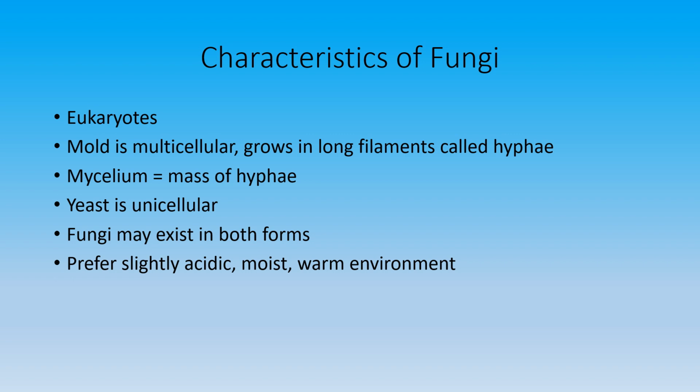Bacteria don't like that. Bacteria prefer more neutral to just slightly basic, like 7 to even sometimes up to 8. So if you want to grow bacteria, bump the pH up a little bit, 7 to 8, somewhere around there. And the fungi aren't going to like that. You may still have a little bit of fungal contamination possibly, but not nearly as much as if the pH were lower. If you're trying to grow fungi, like I say, drop the pH down to maybe 6, and the bacteria aren't going to be happy, so they're not going to grow as well, but the fungi will love it.